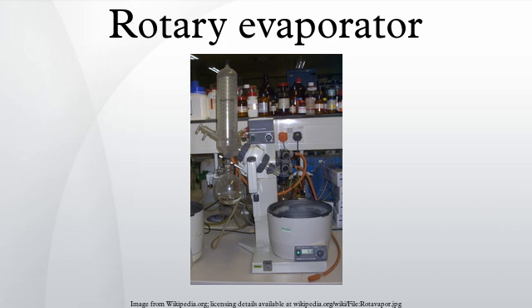Safety. There are hazards associated even with simple operations such as evaporation. These include implosions resulting from use of glassware that contains flaws, such as star cracks. Explosions may occur from concentrating unstable impurities during evaporation, for example when rotovaping an ethereal solution containing peroxides. This can also occur when taking certain unstable compounds, such as organic azides and acetylides, nitro-containing compounds, molecules with strain energy, etc. to dryness.